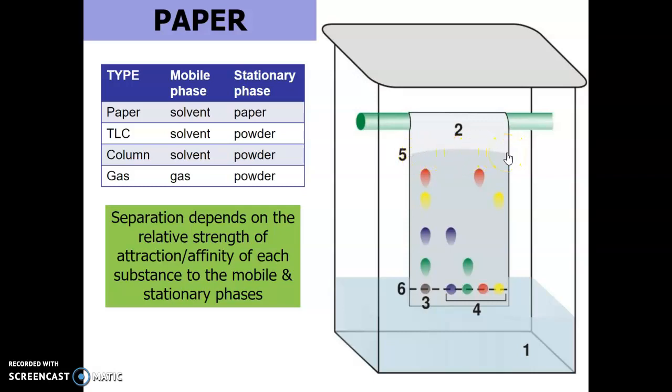And you then would take your chromatogram, that's the fancy word for this bit of paper here, out of the tank, draw a pencil line across there to mark the solvent front, to put where the solvent has travelled to, and then you'd put your chromatogram onto a radiator, one of the nice hot radiators in S1, to dry off.